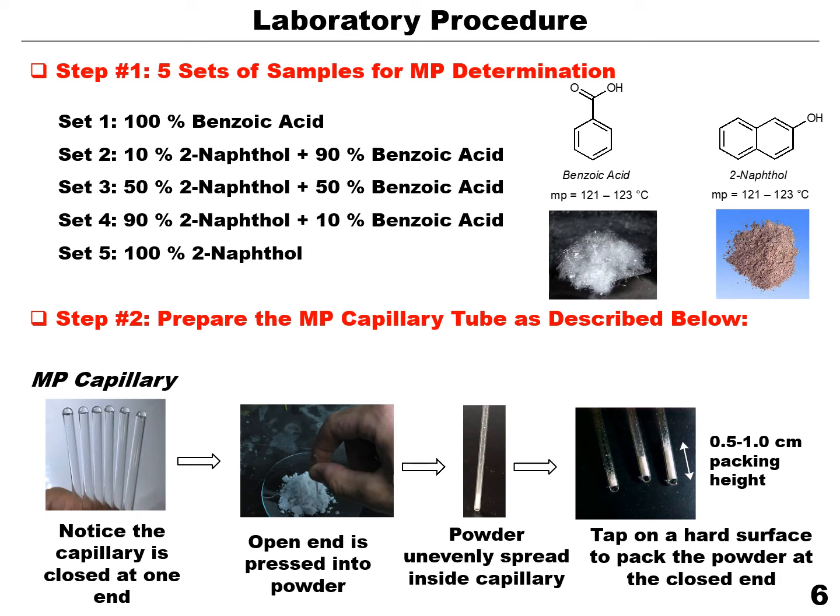Even if your sample is pure, because you have used a lot of the sample, you may end up having a wide temperature range. So it's good to use a sample amount within the recommended range.